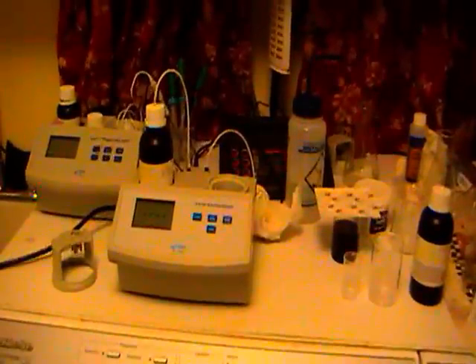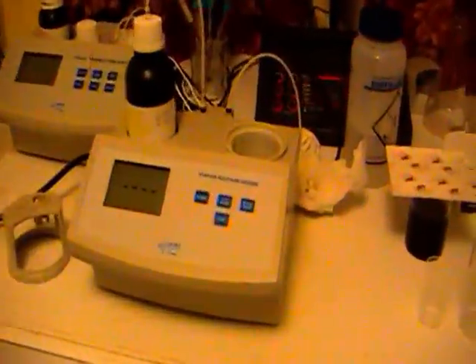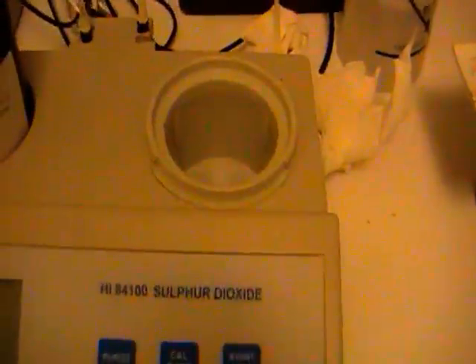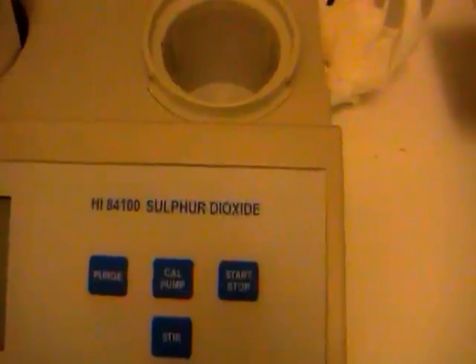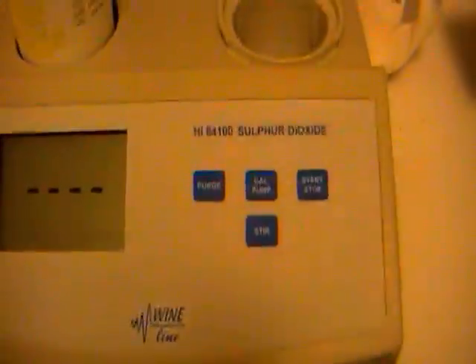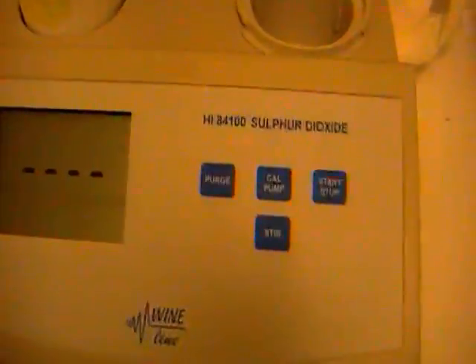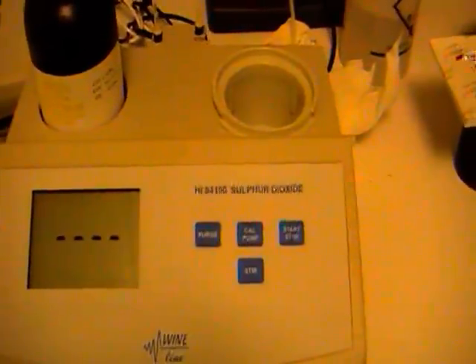Hello again my wine friends, continuing on here with our little reviews of all this lovely equipment we've got here. I thought today we would look at the sulfur dioxide machine from Hanna, the HI84100 sulfur dioxide machine. I got to use this yesterday because it was time to add some sulfur to my wines. I found the machine quite easy to use — I'll give you a quick demo.